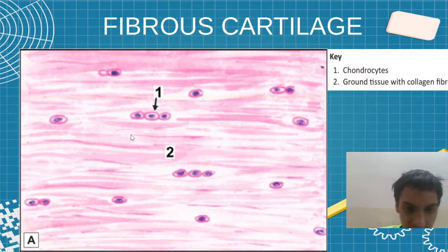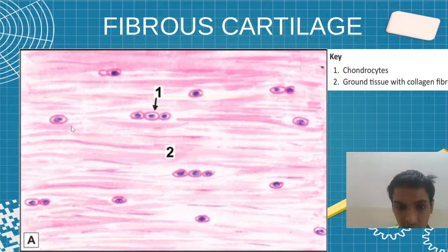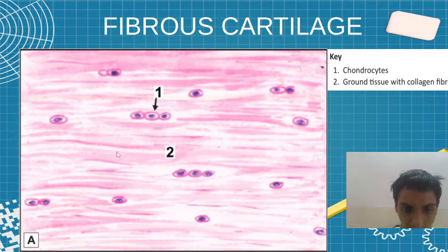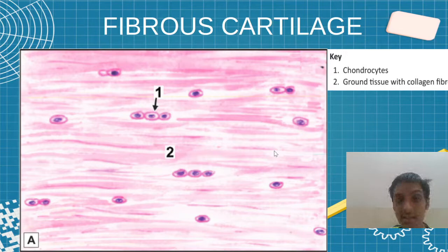Coming to fibrous cartilage, here we have the ground tissue with collagen fibers. That is the important feature - the ground tissue with collagen fibers defines fibrous cartilage.